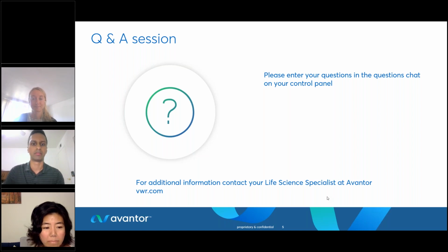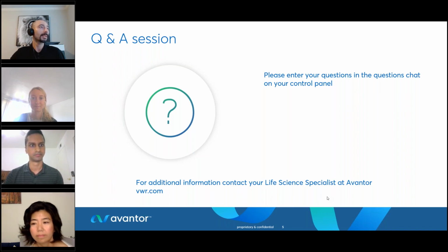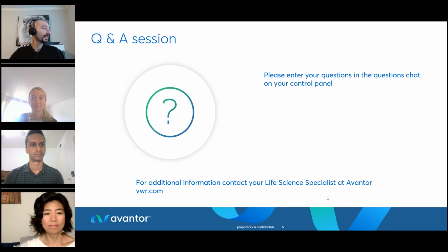Yeah, so our recommendation for phage display libraries and AAV type applications is similar, where we use the rapid barcoding kit for preparation of these samples and downstream sequencing. The analysis pipeline might be slightly different, but from a library prep standpoint, it can definitely be used. Perfect, thank you. Let's move on to the next question.